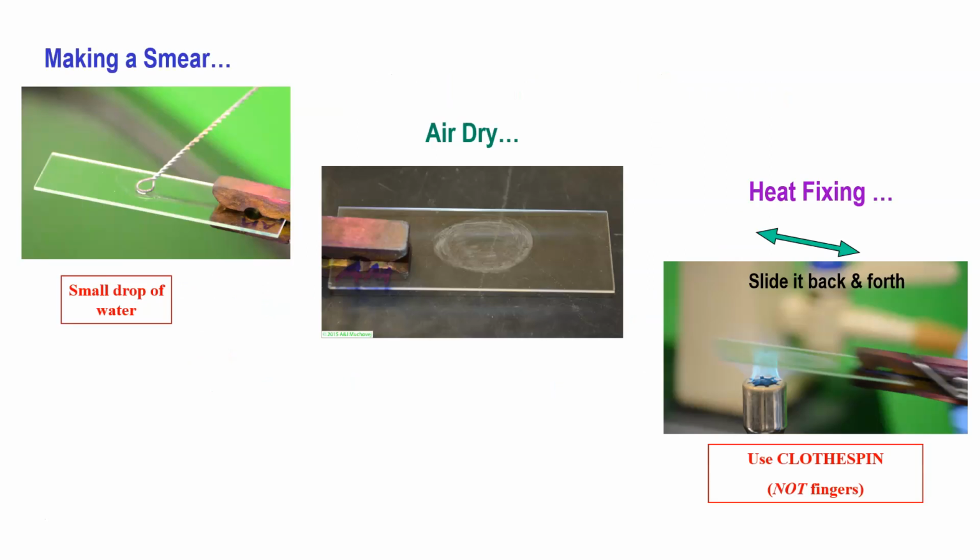You make the smear, you let it air dry, you heat fix it. And we show you all that in that video.